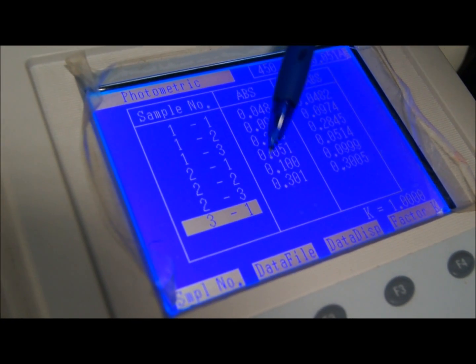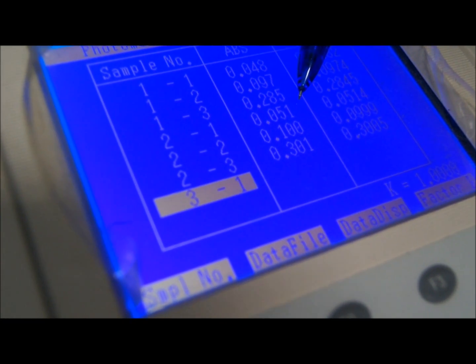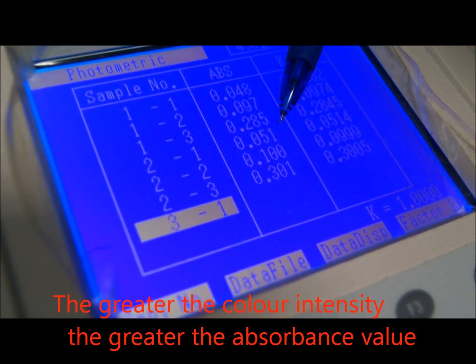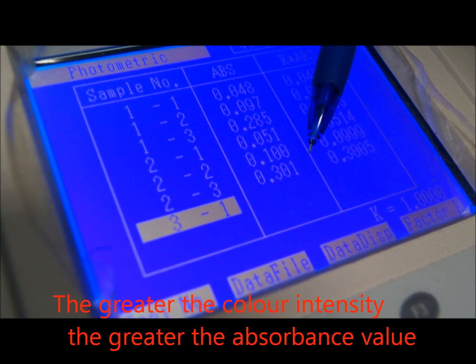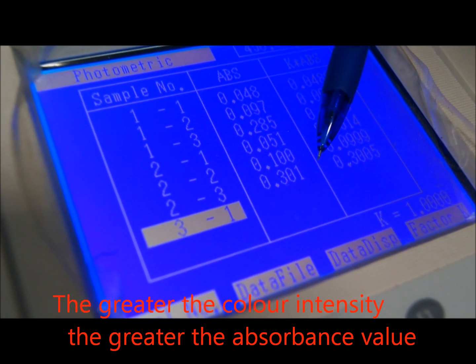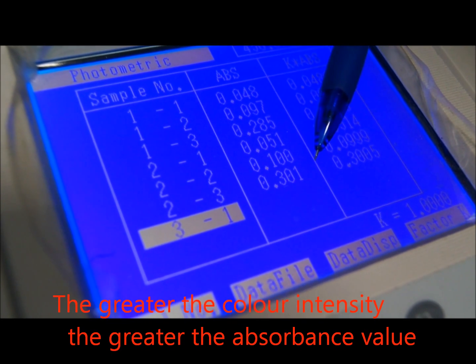So these are the readings that we should take note of the absorbance, and you can see that also according to what we saw visually, the absorbance increases with color intensity. The darker the color is, the more light it absorbs at that particular wavelength.